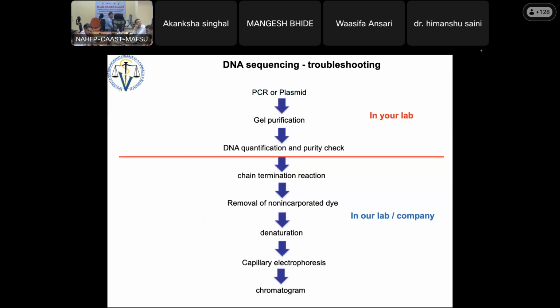Okay, so till now we saw what could be the problems in your laboratories and how to tackle those problems, and now we can see the company is not always right. The company can make some problems, and the company can fail the Sanger sequencing.